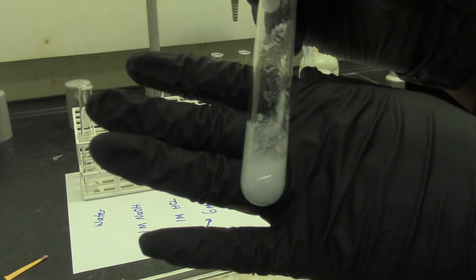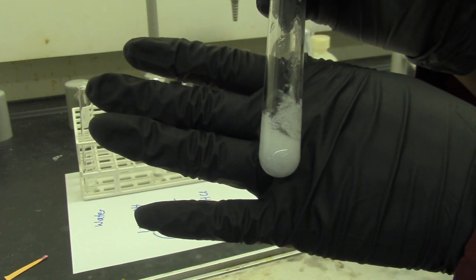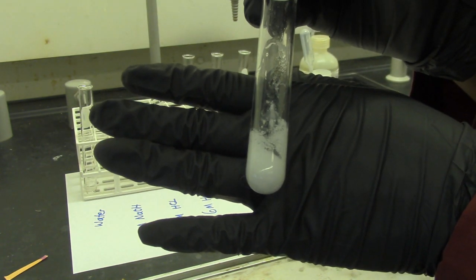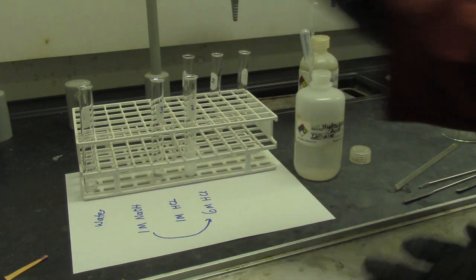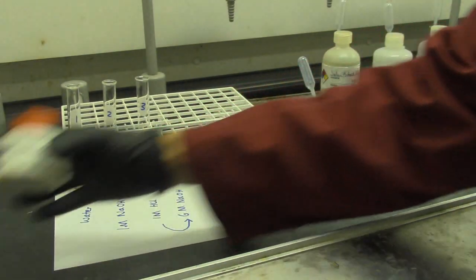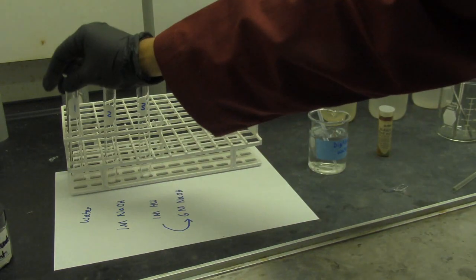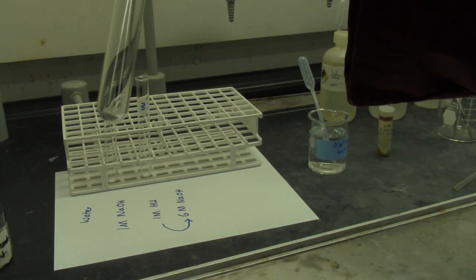So again, determine whether soluble or insoluble after adding 6 molar hydrochloric acid to test tube number 2. Next, we have ethyl 4-aminobenzoate. In each test tube, we have 30 milligrams of solid.